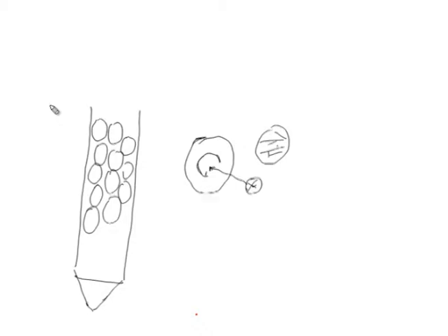So, the larger molecules will only spend time in the interstitial spaces, or the space surrounding the stationary support material in which the stationary phase is contained.